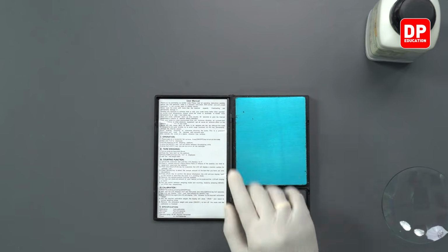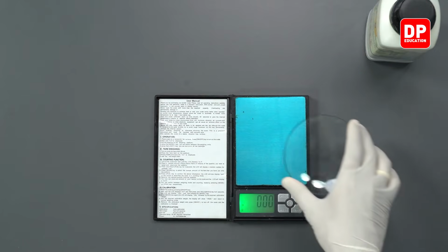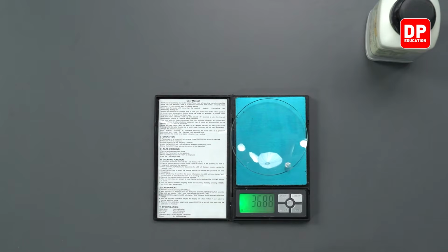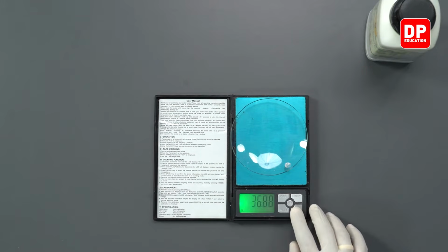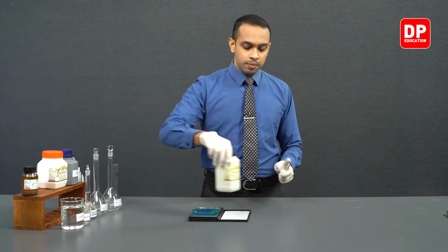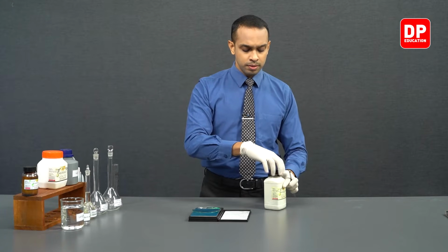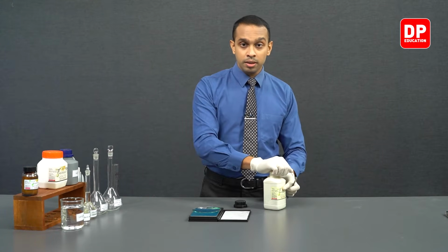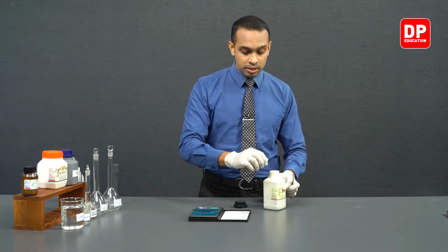We have our digital balance here. We'll turn it on again. We can see the unit is in grams, and we are going to place our watch glass on top of the balance, and then we can use the tare function to get to a zero reading on the digital balance. Afterwards, we will be measuring 12.05 grams of ammonium ferric sulfate or ammonium iron(III) sulfate.